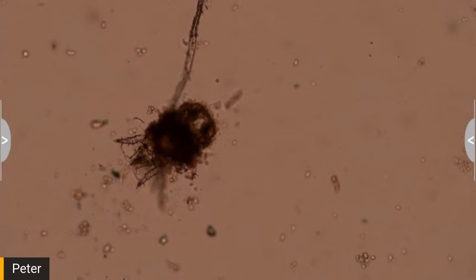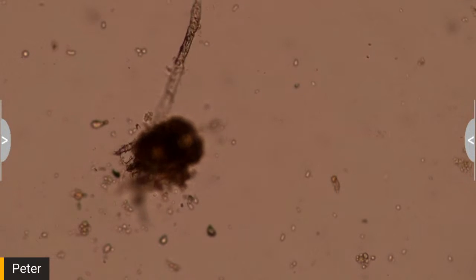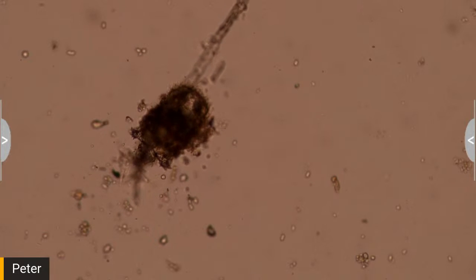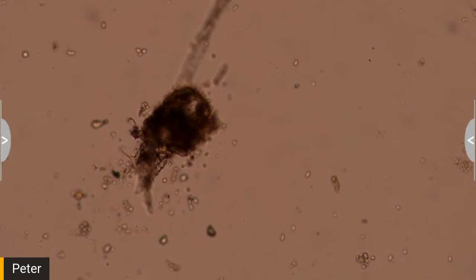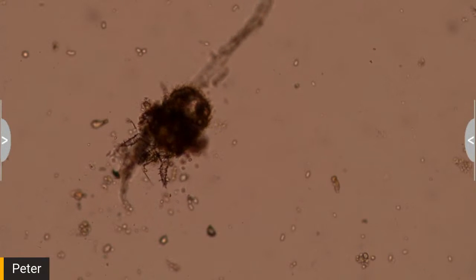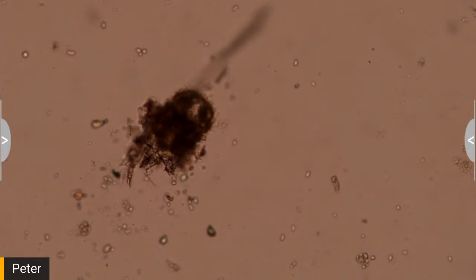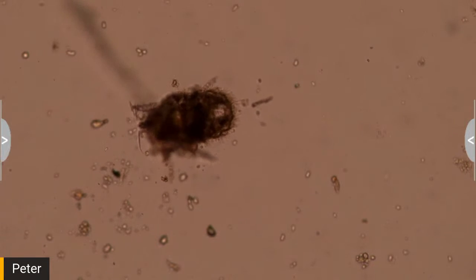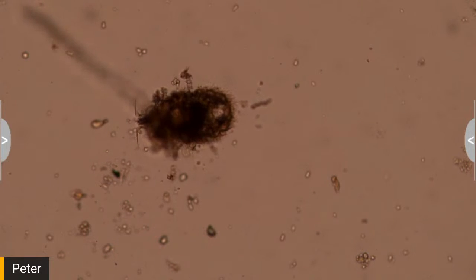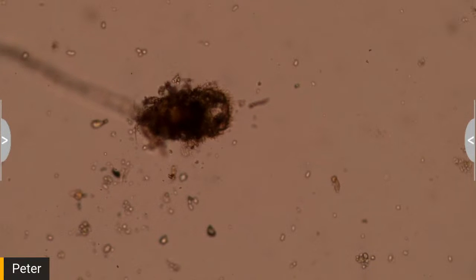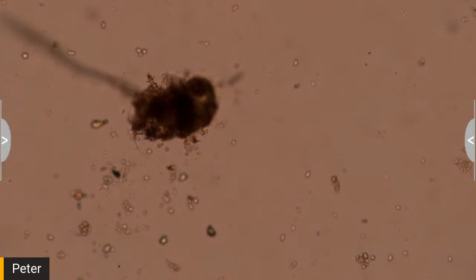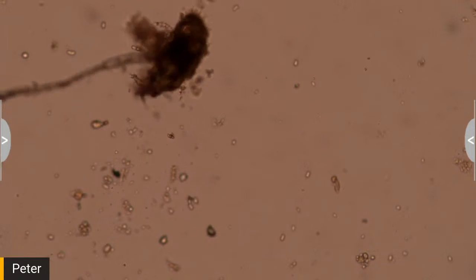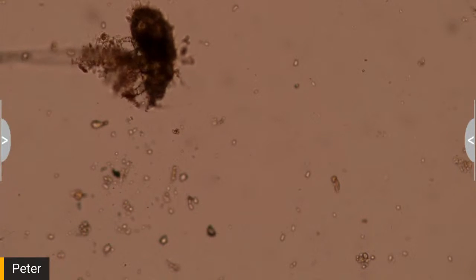Flailing around. I wish you didn't have that thing on top of you. I thought it was a tardigrade, but it's basically from my worm bin.